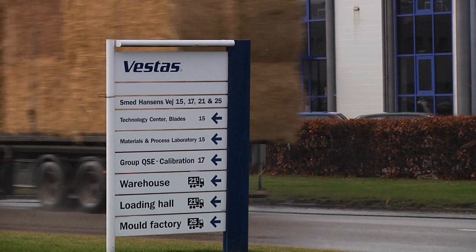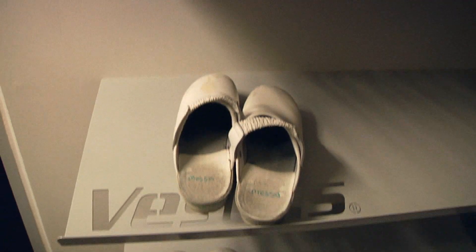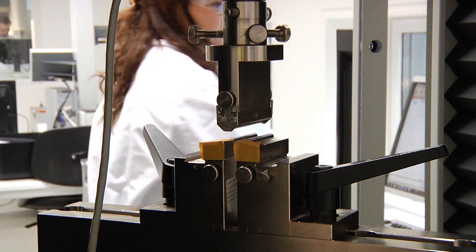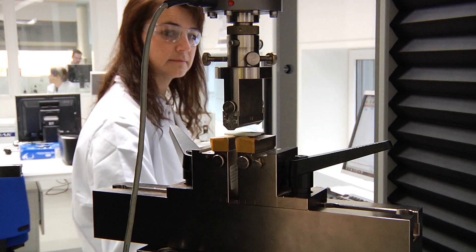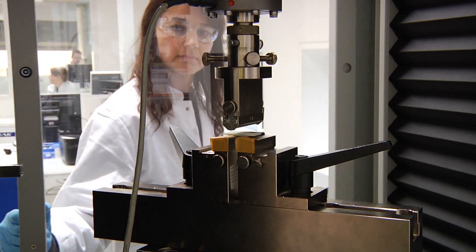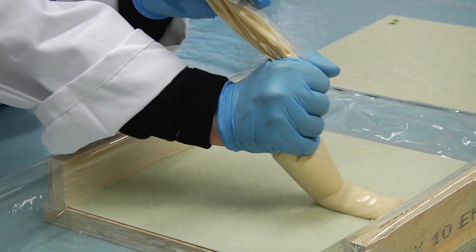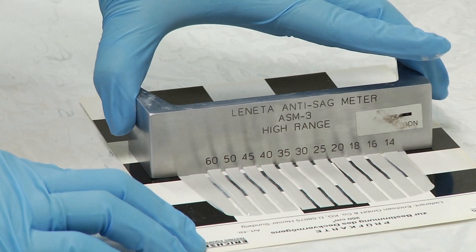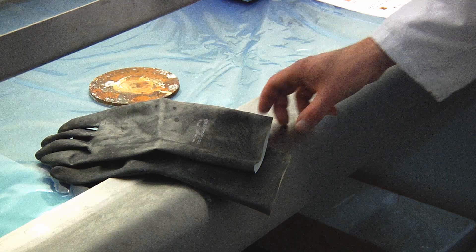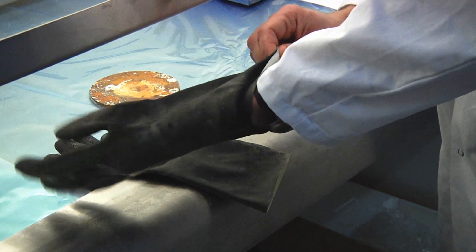In a small testing laboratory on the west coast of Denmark, the chemical properties of the materials which go into Vestas' blade production are put to the test. Analysis of materials such as the carbon fibre composite, glue and even the paint is important to ensure that the quality is of the highest level. Comparison of different suppliers identifies the cheapest high quality materials and cost savings for the blade production.